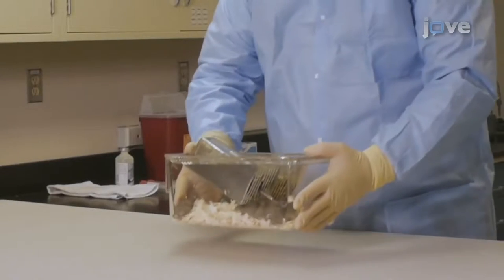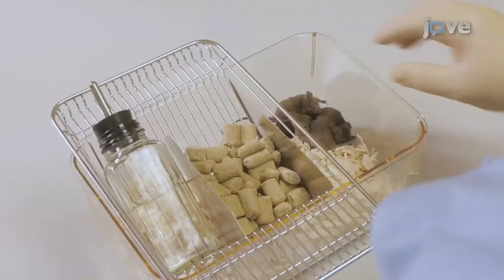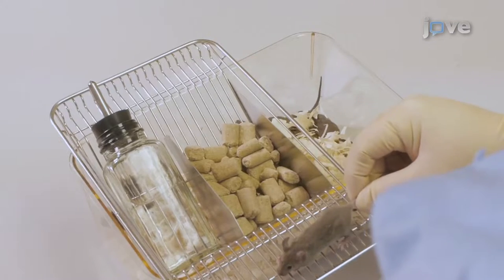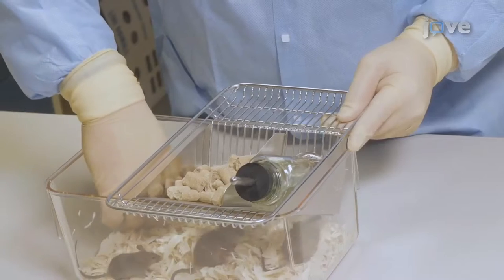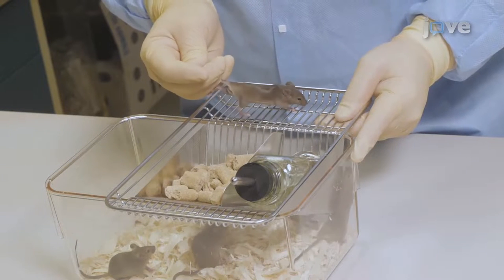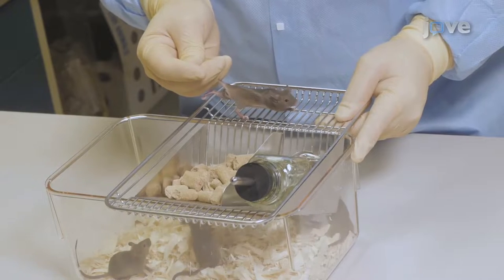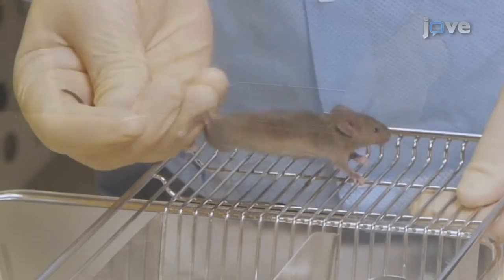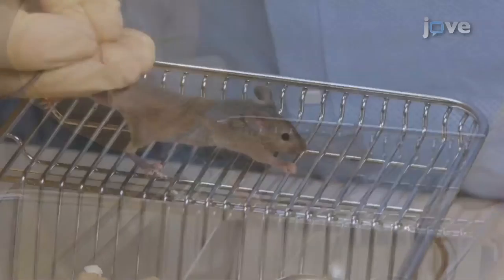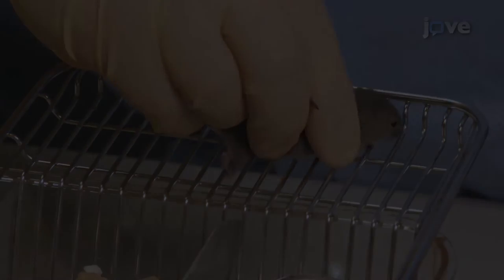Mice can be restrained manually using either a one- or two-handed technique. The first step of either method is to gently lift the mouse by the base of the tail onto the cage lid, wire bar cage top, or a similar rough surface. For the one-handed technique, tuck the base of the tail between the third and fourth finger while gently pulling back on the tail. This will cause the mouse to grasp the surface and pull forward. Next, firmly grasp the mouse by the scruff with the same hand that is holding it.